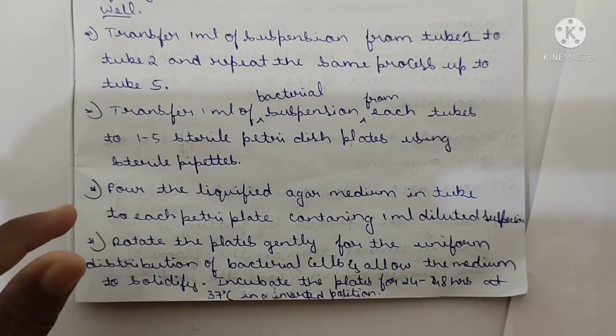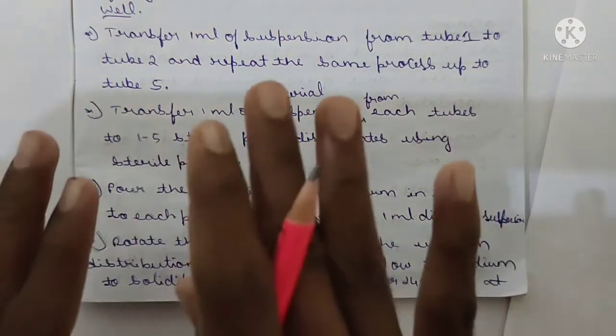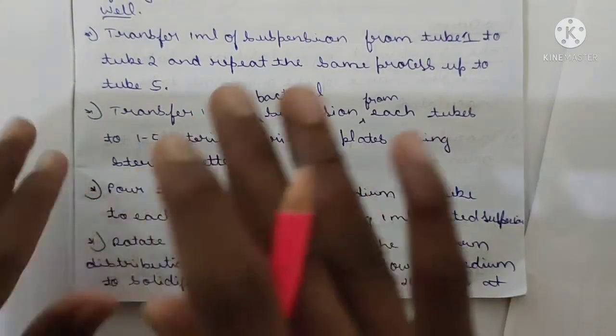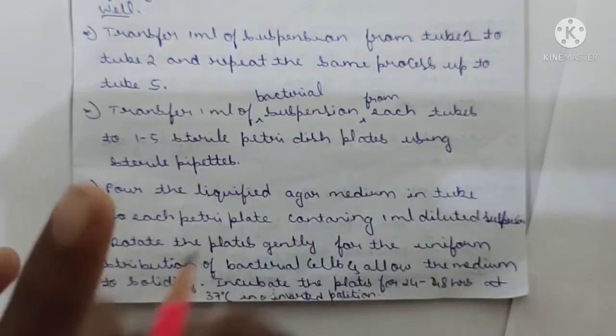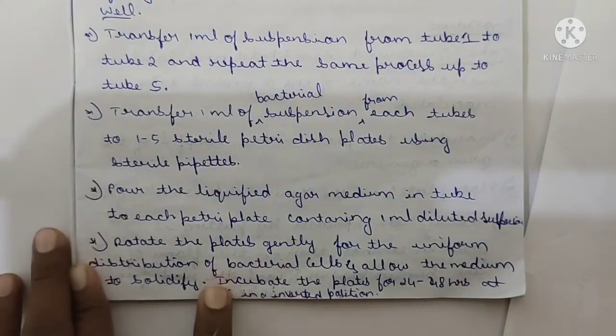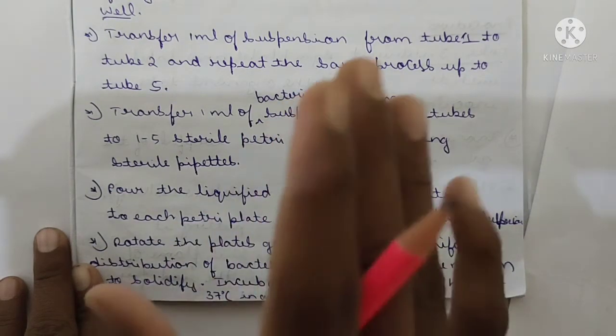Okay. Then what do we have to do? We have to allow that medium to solidify. After solidifying, incubate the plates for 24 to 48 hours. We have to keep those plates in warm conditions for 24 to 48 hours, maintaining the temperature at 37 degrees Celsius, in the inverted position. Okay, we have to maintain that.